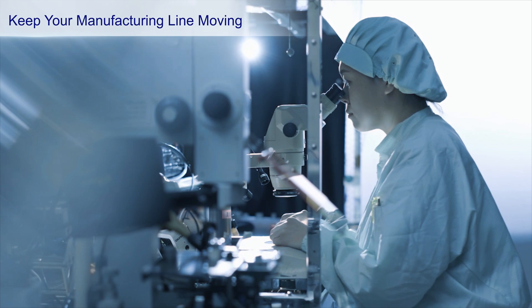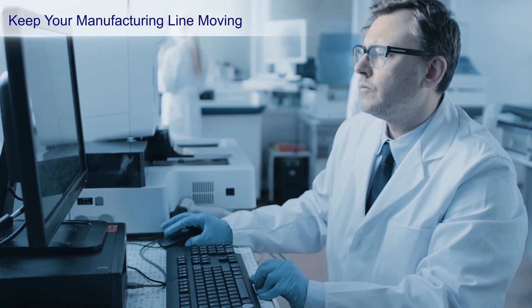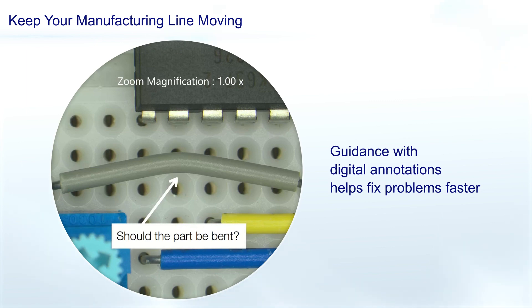If there's a problem, an off-site manager can provide remote guidance using third-party software like Microsoft Teams and see what the assembler sees through the eyepieces. The system also makes it easy to make digital annotations or record images and videos to capture details and fix problems faster.